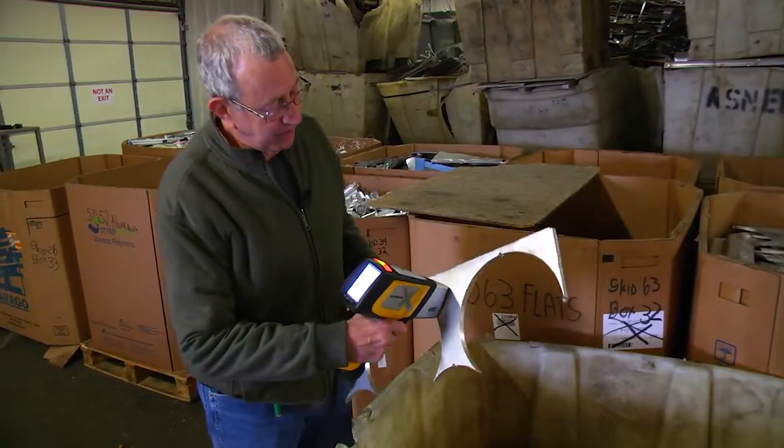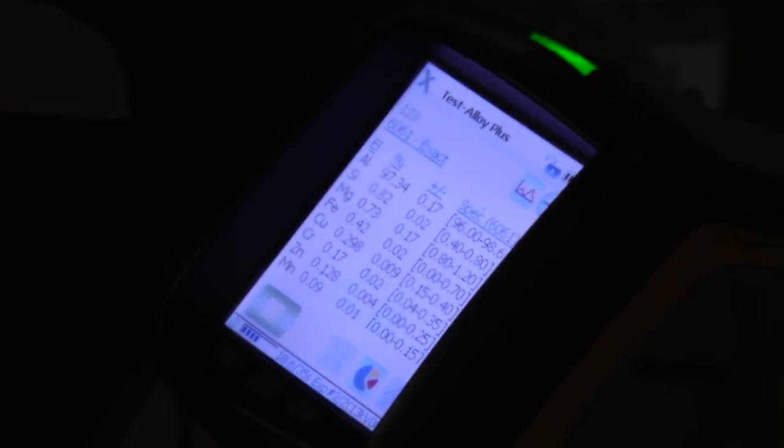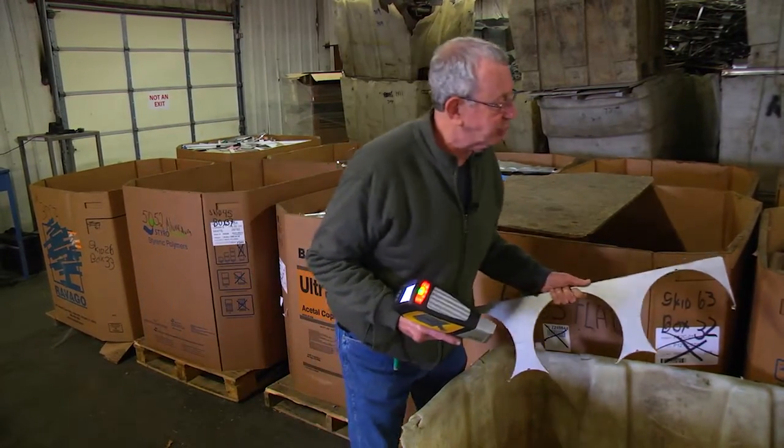Here's another piece of some thick aluminum. The gun shows that this is 6061 exact, so you sort of have a checks and balances within the analyzer itself.